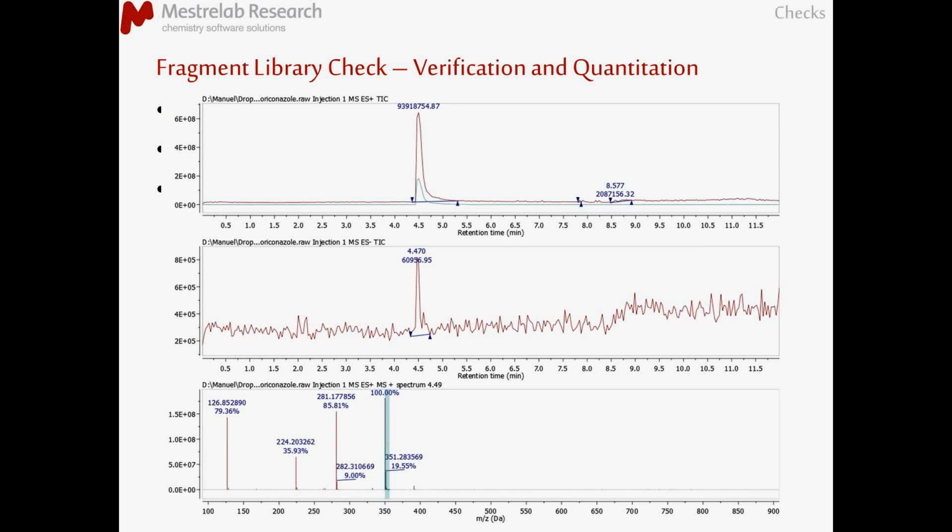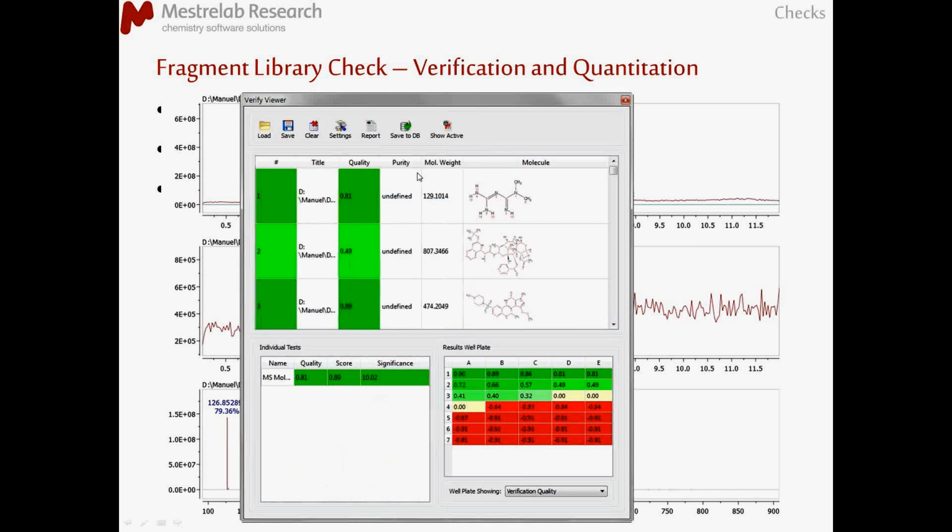In this sense, we will end up with automated analysis, like in this particular scenario, where we can see that our fragment is present in solution, not as pure as maybe we would like, and we will end up with a full report saying which fragments are present and which are not. This particular example uses just LCMS data, which for some of you may be more convenient. Okay, so moving into acquisition, there are several things worth mentioning.